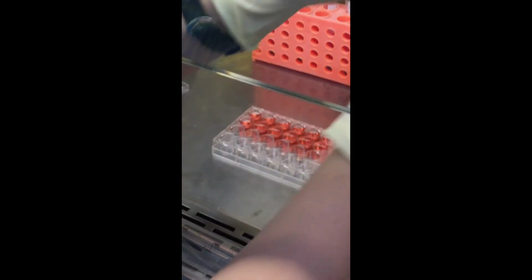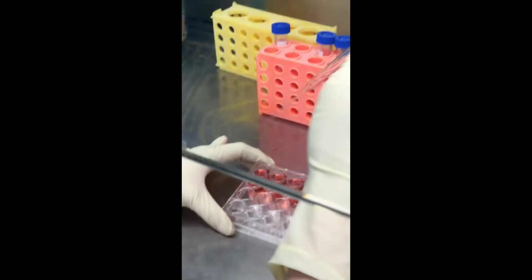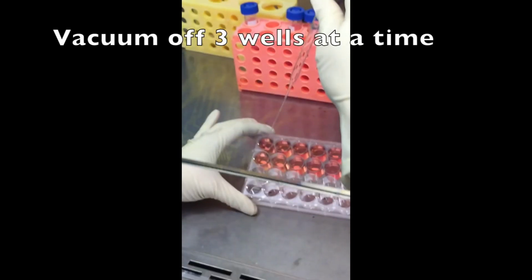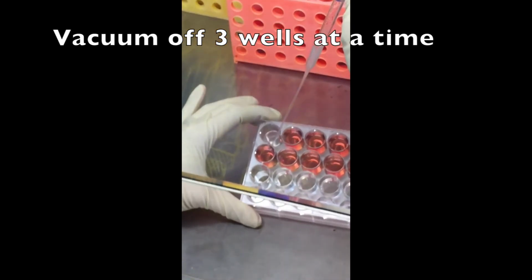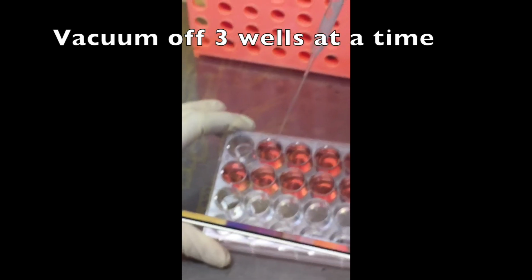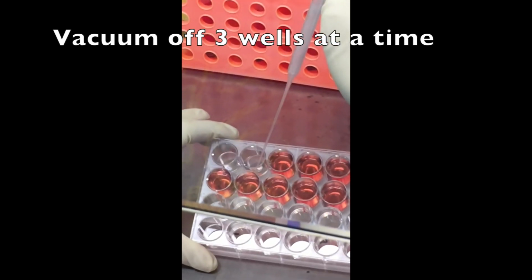You don't want to leave any of the wells without media for too long. So I'm going to slide the pipette down the back of the well and just gently touch the bottom of the well. Because remember, your cells are stuck on the bottom, and so you do not want to vacuum them off.